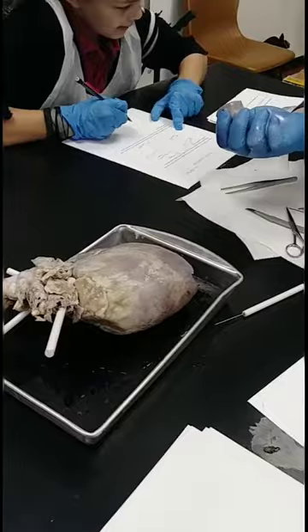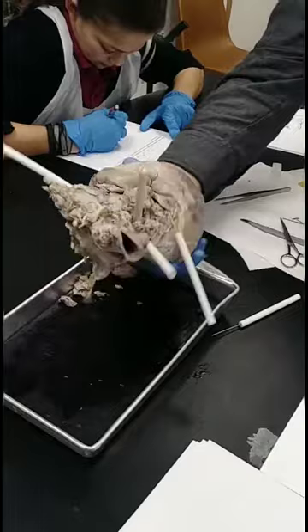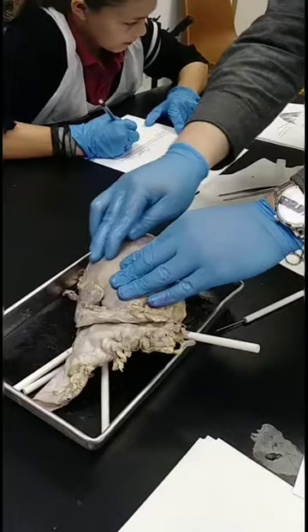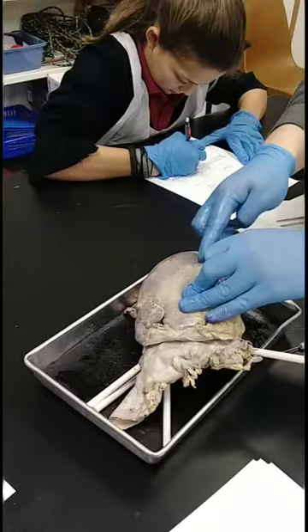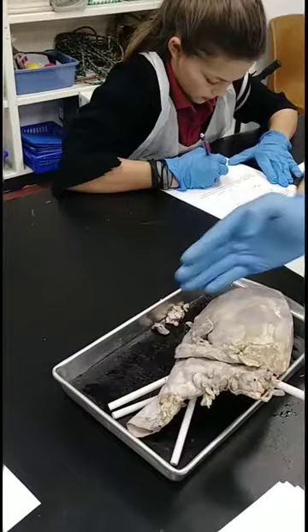When you've got all of step two done, go ahead and think about cutting into this so we expose some of the ventricle. We'll spend more time with this tomorrow, but I have a large knife up here to help you guys out. We'll try cutting in to see more of this myocardial tissue, the muscle tissue. Make sense? Right in that groove that separates the left ventricle over here, and the right ventricle, right?